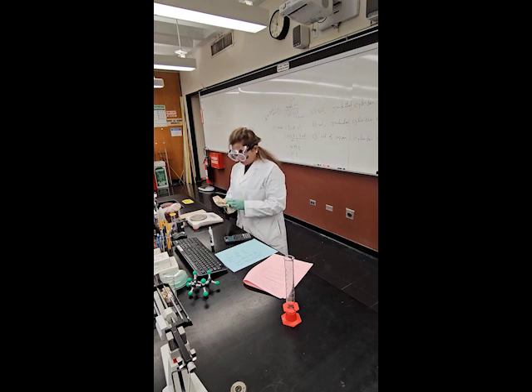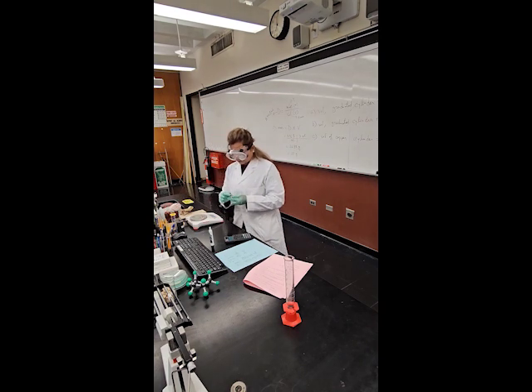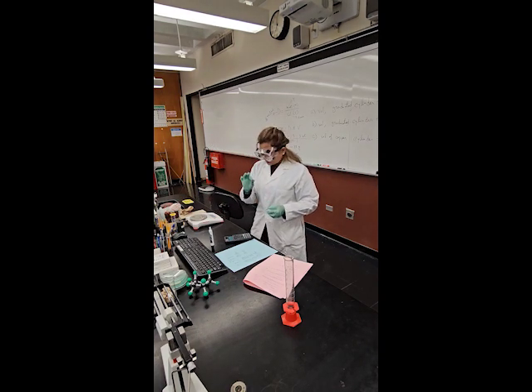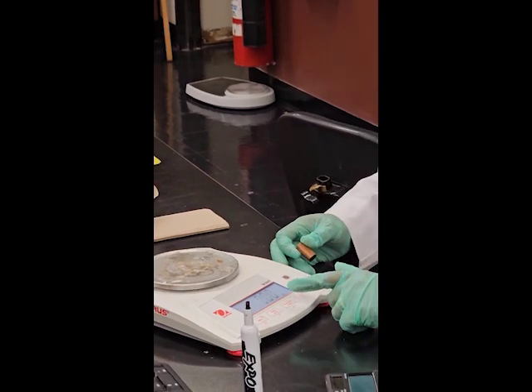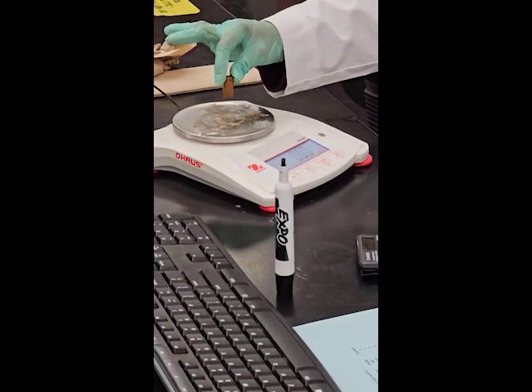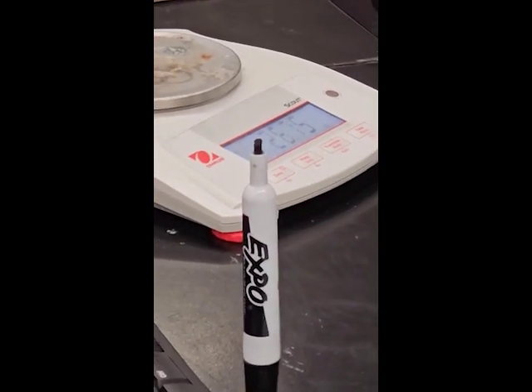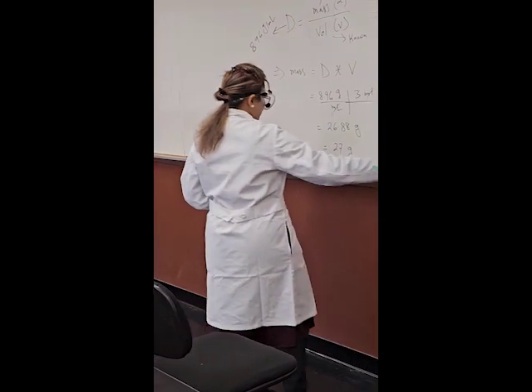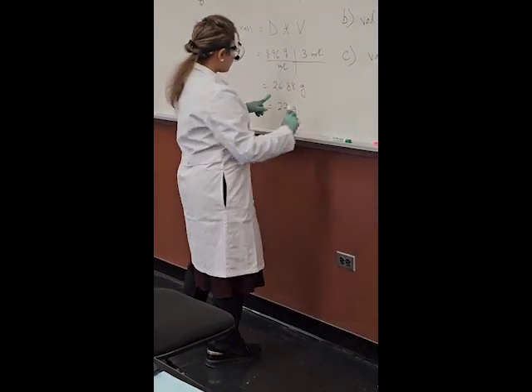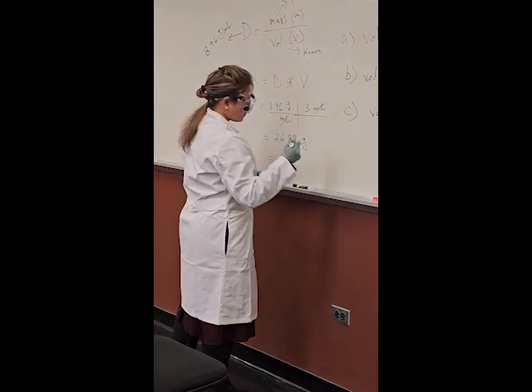Is dry, no water. So this copper cylinder, you can see this is already in 0.001. So now I'm putting it here. It's 26.75 almost. Okay, 26.75. Actually, if I don't round it out my answer, so this is correct. Almost correct. 26.75, right?